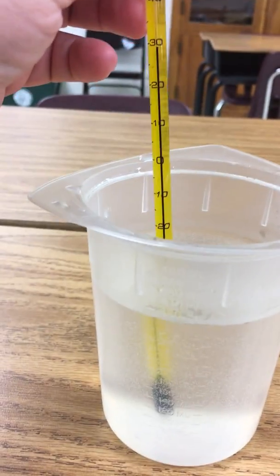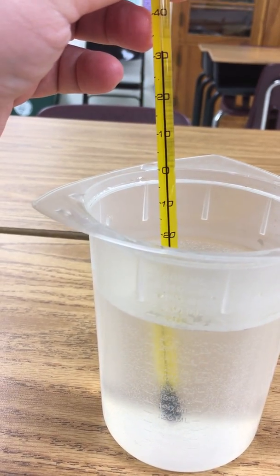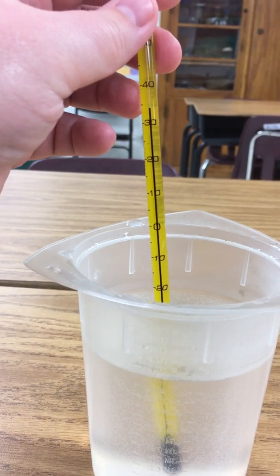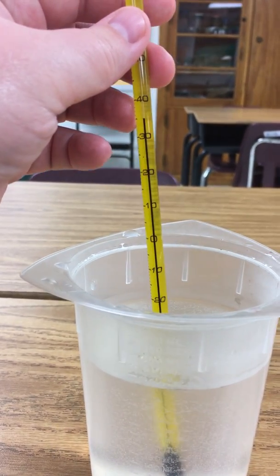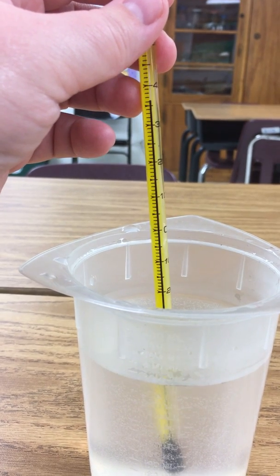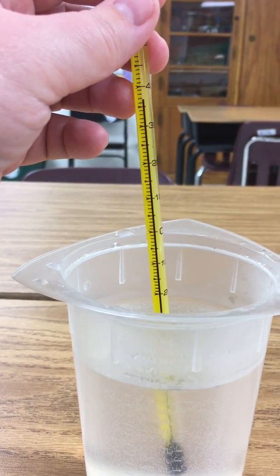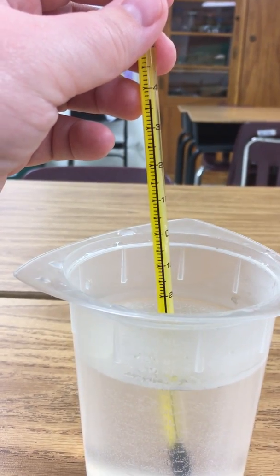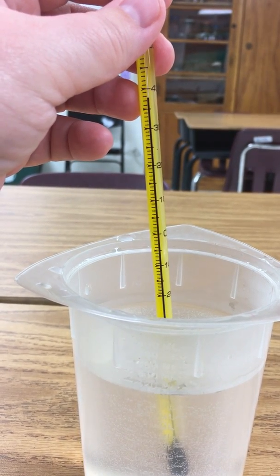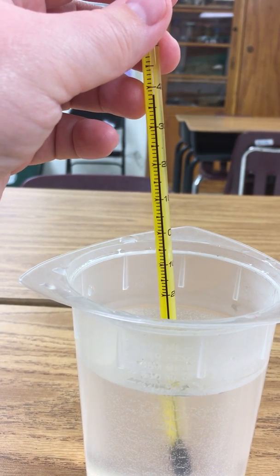So what I've done is placed the bulb end of the thermometer into the liquid, and I notice immediately that the liquid inside the thermometer is going up. That tells me the temperature of this liquid must be kind of warm, possibly even hot. So we're just going to wait for it to stop before we make that measurement.